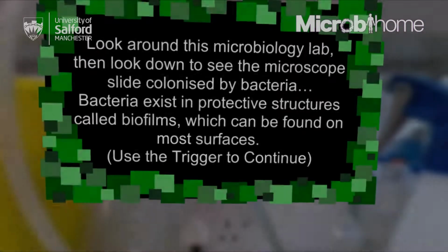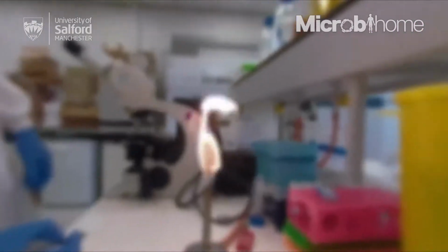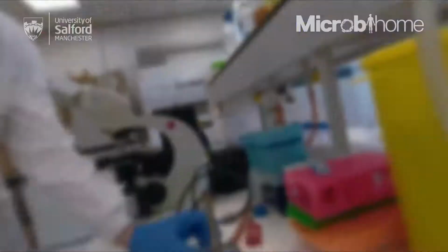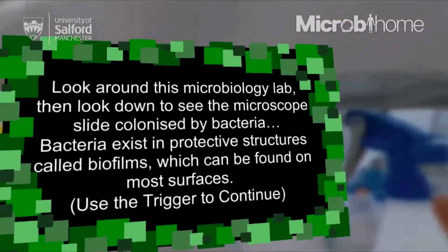Look around this microbiology lab. Then look down to see the microscope slide colonized by bacteria. Bacteria exist in protective structures called biofilms, which can be found on most surfaces. Click the trigger on your handset to continue.